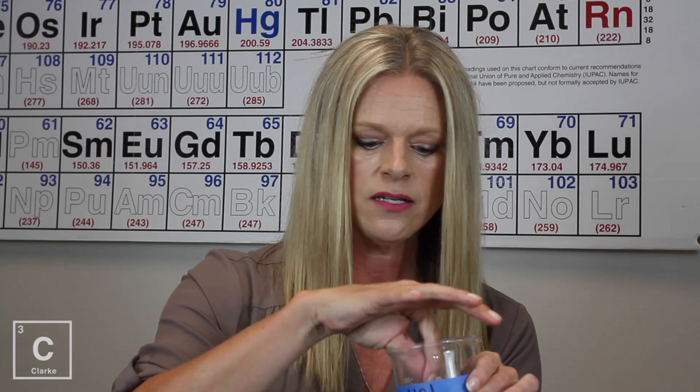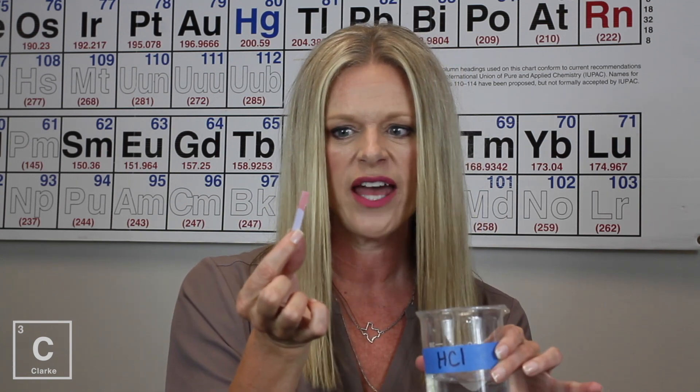If you were to test an acid with a piece of blue litmus paper, litmus paper, these are good for indicators. Now the litmus paper that I used before changed different colors and it gives you a pH range. Red and blue litmus paper just tests between acids and bases. It's not going to tell you the pH. Blue litmus paper, when you use it to test an acid, is going to turn red or pink. That shows us that it's an acid.